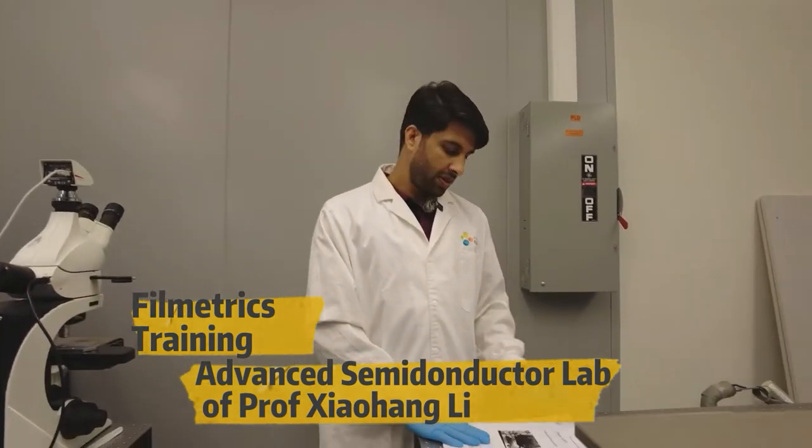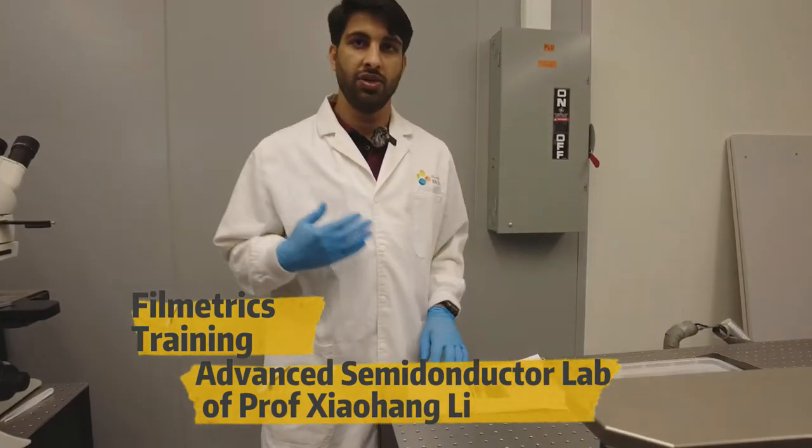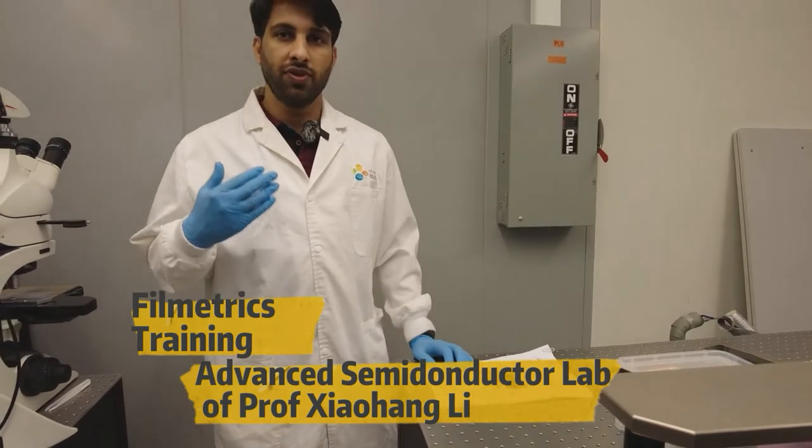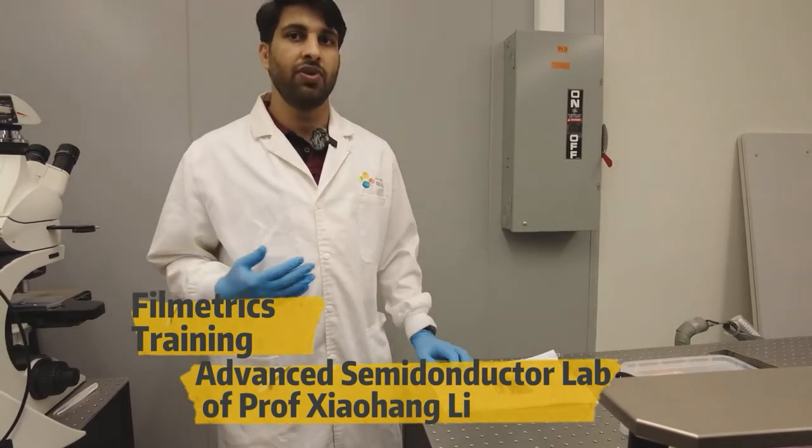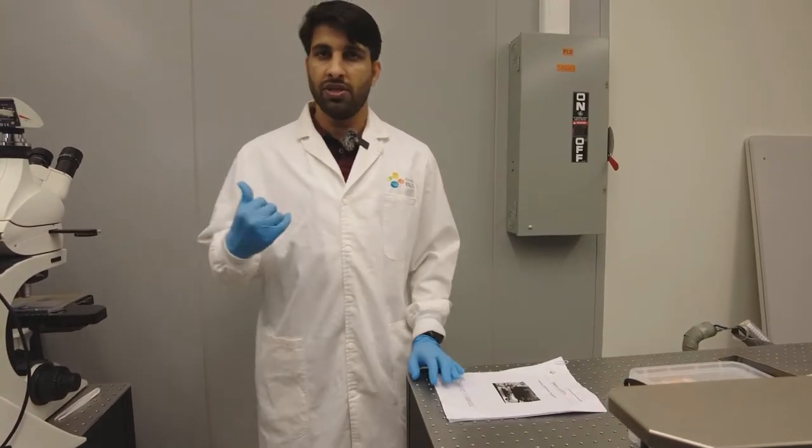This is the SOP for the filmetric. So this system is basically used for measuring the thickness of the grown film as well as the refractive index. It measures with the principle of reflectance measurement.